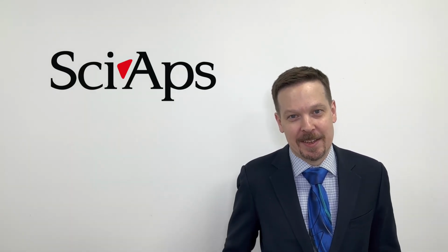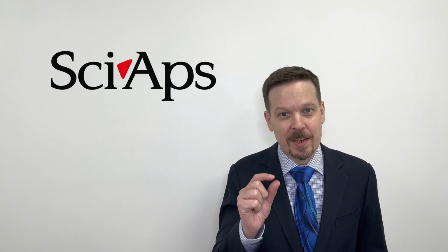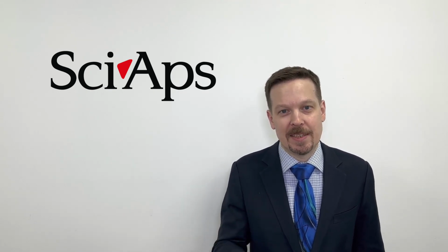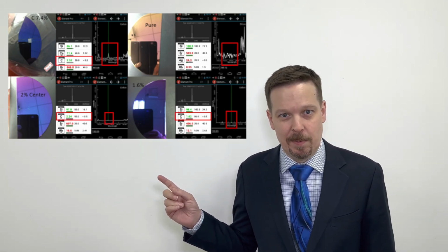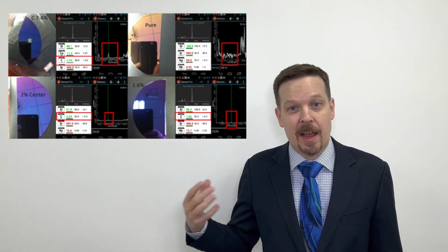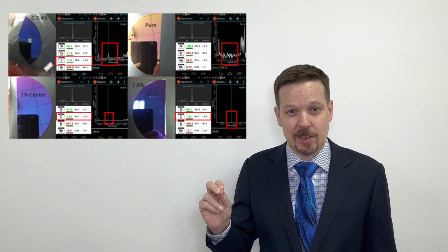Okay, the second aspect of TMA is qualitative analysis. This includes 2D mapping, and it also includes just focusing on an individual spot or location that you want to identify what elements may be present in a sample. A good example of this is in electronics testing. Usually in a clean room environment, they want to test the surface and see what kind of contamination has got on the sample. So in these cases, they'll use something like Element Pro. Test just the surface. Just take one shot, one location, and try to identify the contamination on the surface.